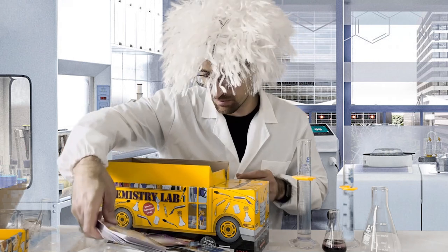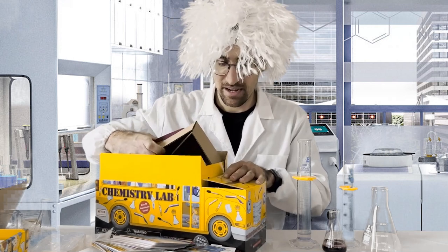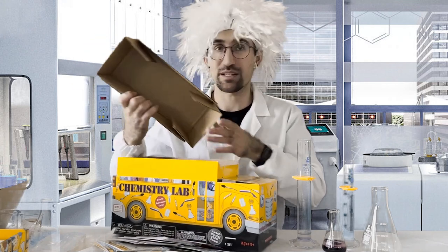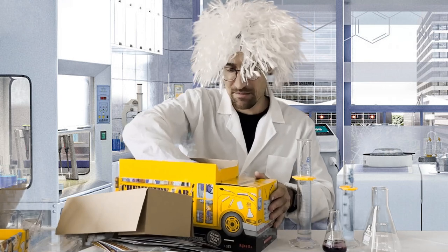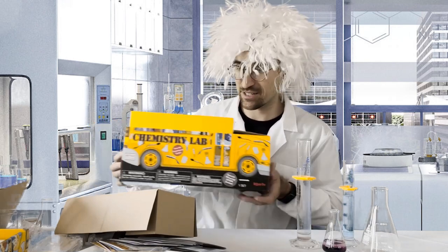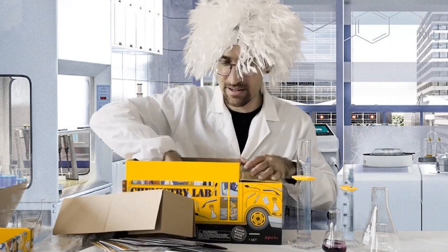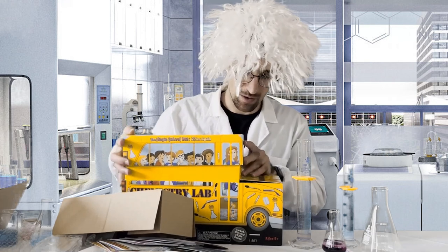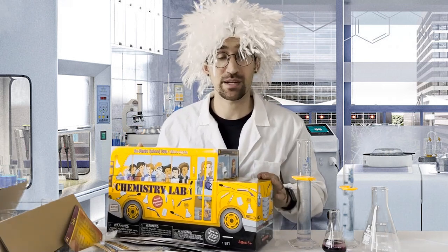That's really the key items inside this box. I will say there is a lot of cardboard and not all of it is usable — it's got a bit of filler cardboard to make it look bigger than it actually is. That being said, once they're done with their experiments, you can keep this as a storage box, with materials nicely placed back in for later use since they probably aren't doing all the experiments at once.